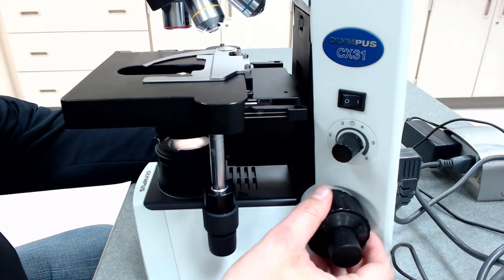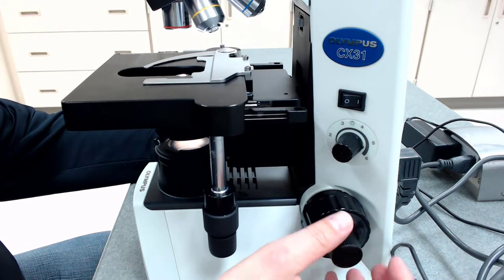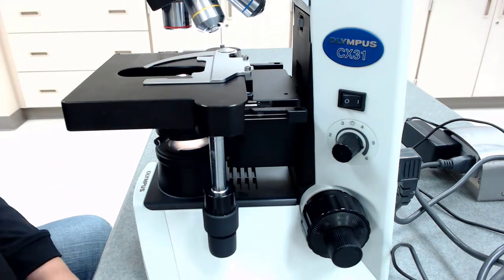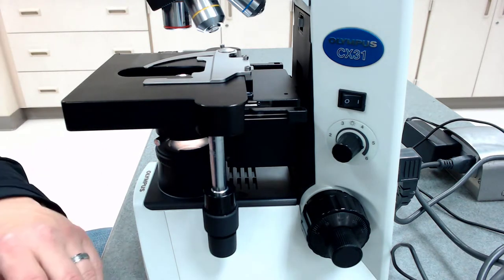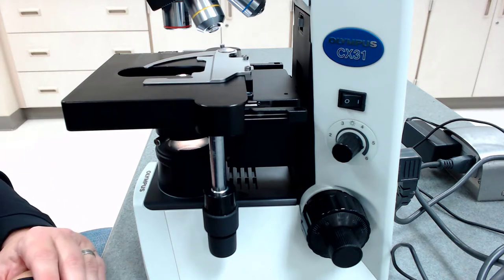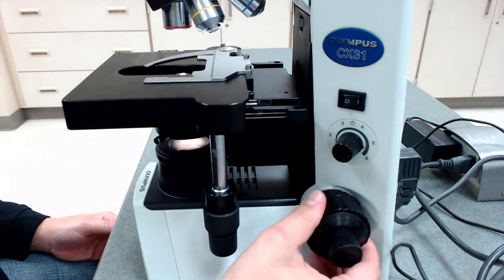So the coarse adjustment knob is what I use to get into the right ballpark. But to actually focus your specimen, you need the fine adjustment knob. So generally speaking, I only use the coarse knob for the first two objectives. So that's how you can control the light intensity and how you can move your slide.